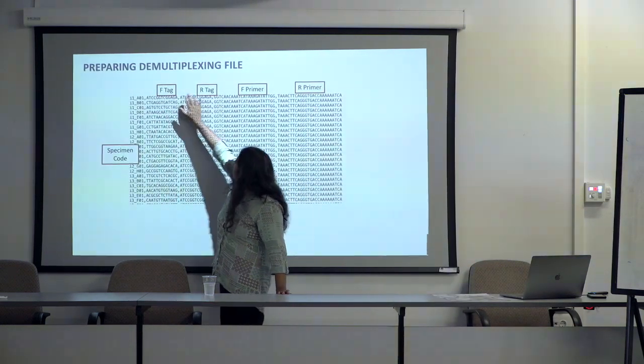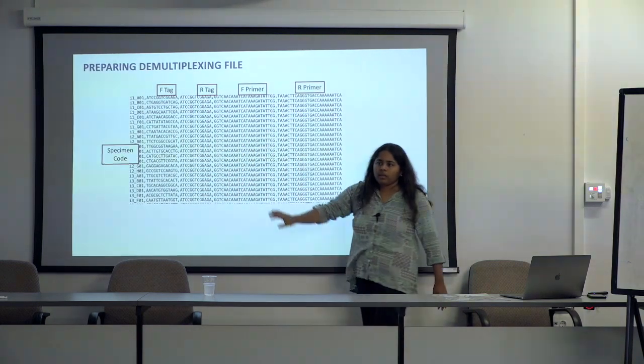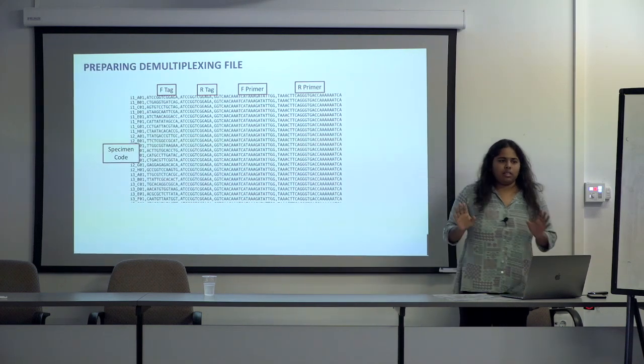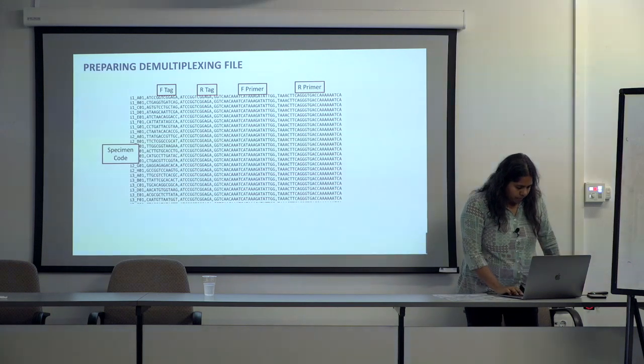You have the forward tag with the forward primer, reverse tag with the reverse primer over here. So just keep that information separate in a CSV file, and that's all that's needed in terms of your specimen information.